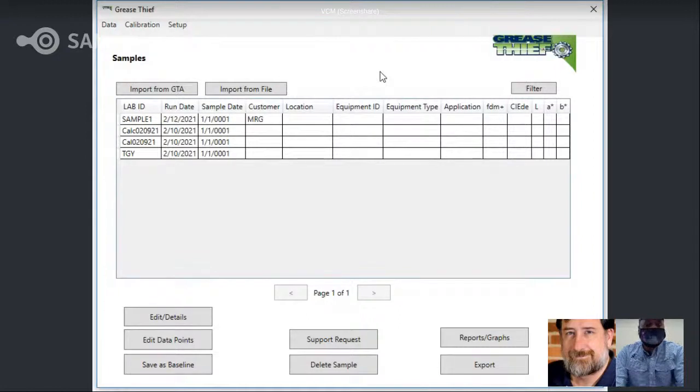Next question I see is, is the grease rehomogenized during the extrusion process? If so, does it have any impact on consistency or shear readings? So answer here is, to a certain extent, there is mixing as the grease is rearranged as it travels through the flow channel. But no, the sample does not homogenize the grease prior to testing. That would change the consistency of the sample state if you would homogenize the grease.